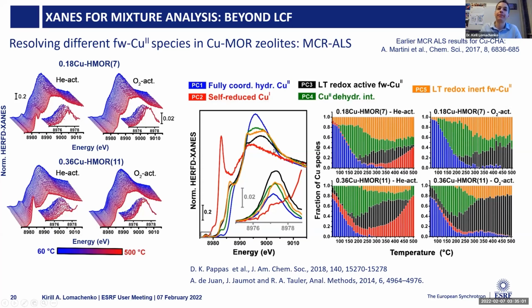And when we know all this, you can put some meaning into the concentration profiles that you obtain, because apart from these 5 spectra you obtain, how do their weights change during your protocol?